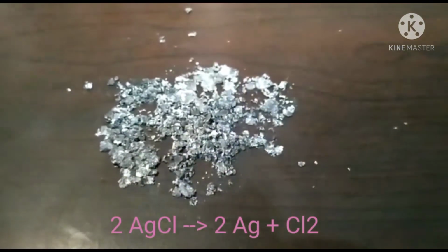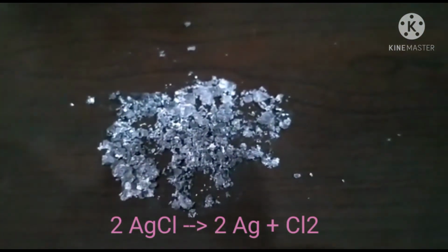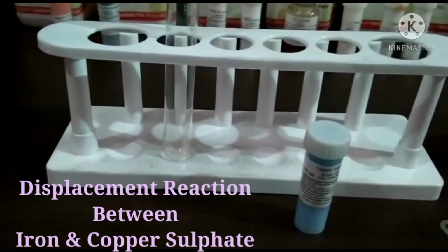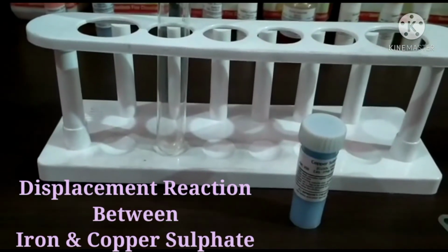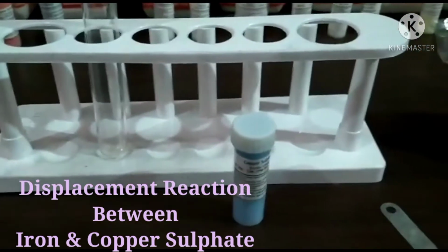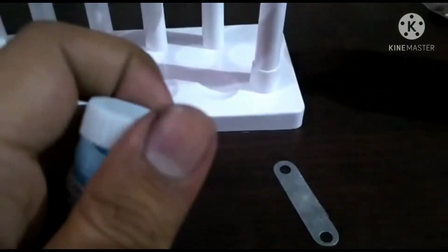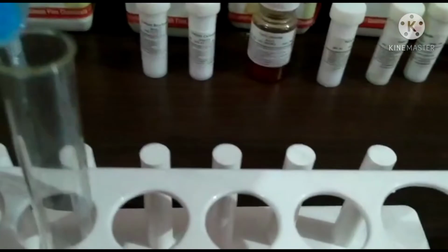This is the reaction of photolytic decomposition. Next reaction is the displacement reaction between iron and copper sulfate. Iron is a silvery or grayish color compound. Copper sulfate is a blue color compound.